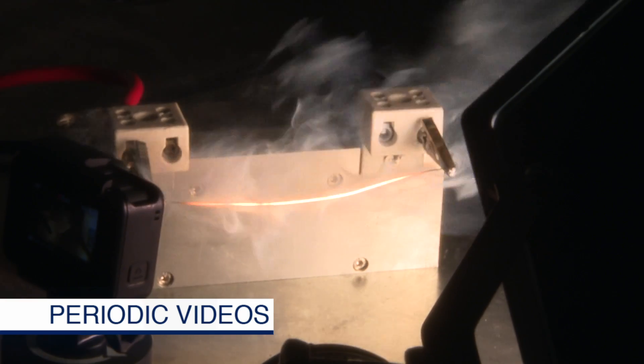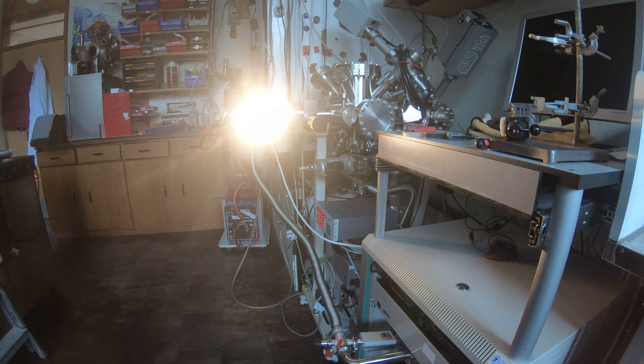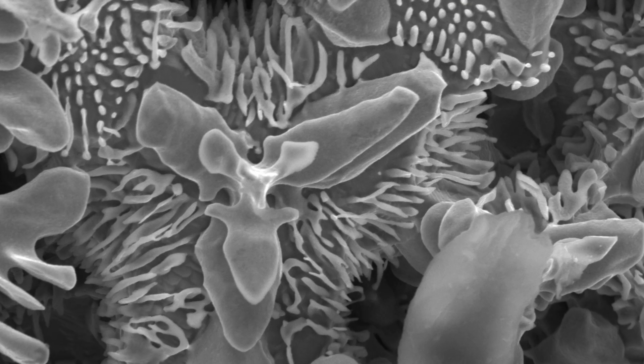Today I'm going to tell you some more about molybdenum wires and show you some amazing micrographs — pictures the likes of which I've never seen before.